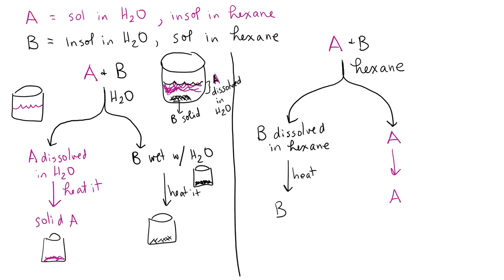And that's all there is. So you heat it until it boils to evaporate it away. And this, again, this process is using solubility in order to then dissolve a substance selectively. We're selectively dissolving a substance and then decanting it away from the other one.